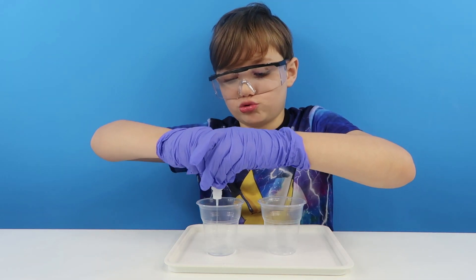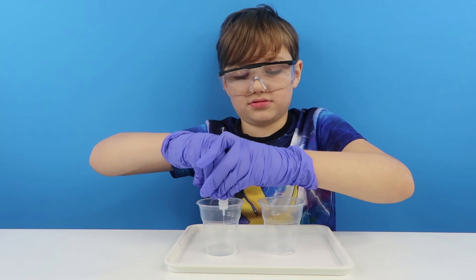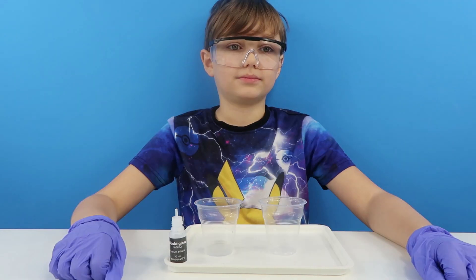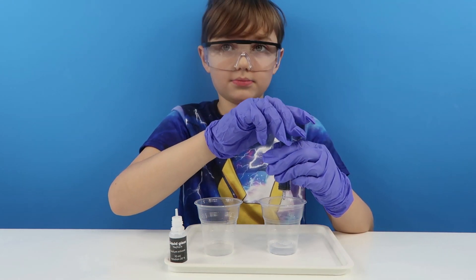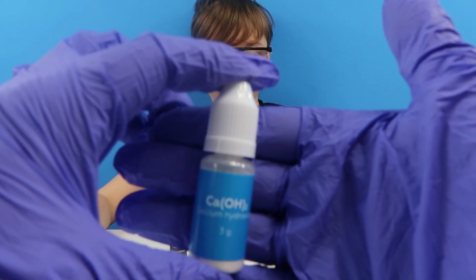Probably has been used. Right. Now in the next one you need to put 10ml of water — okay, thank you. And then the bottle of calcium hydroxide.